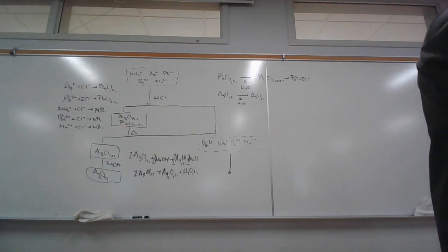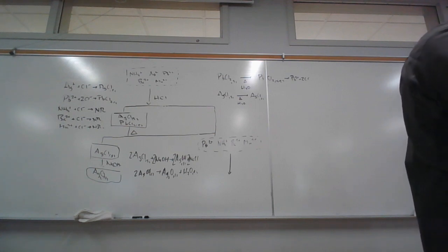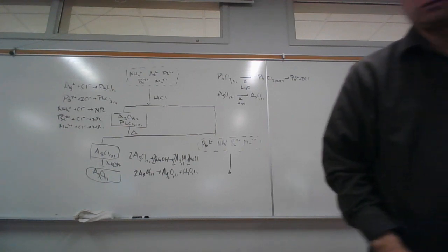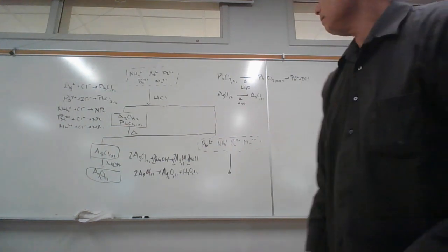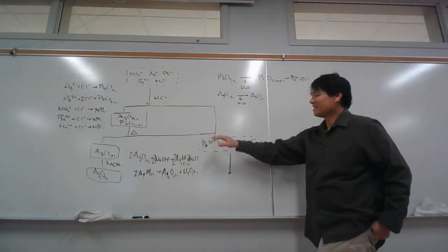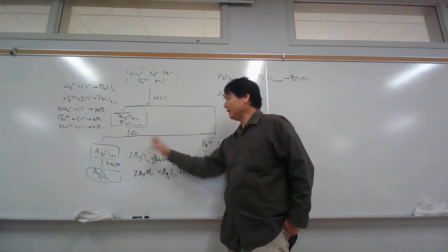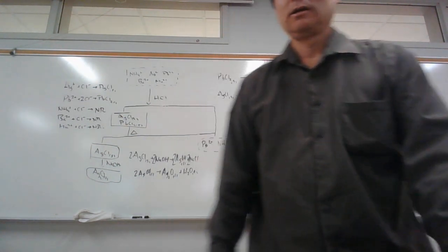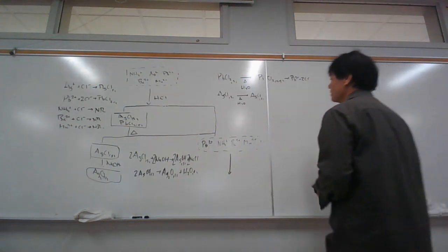It's called your filter cake. This is your filtrate, your precipitate, and your... They also call this solution here the supernatant. So filtrate or supernatant. All right, so we got this cleanly separated. Clean separation is what we want. Clean separation is going to give us good results for this.